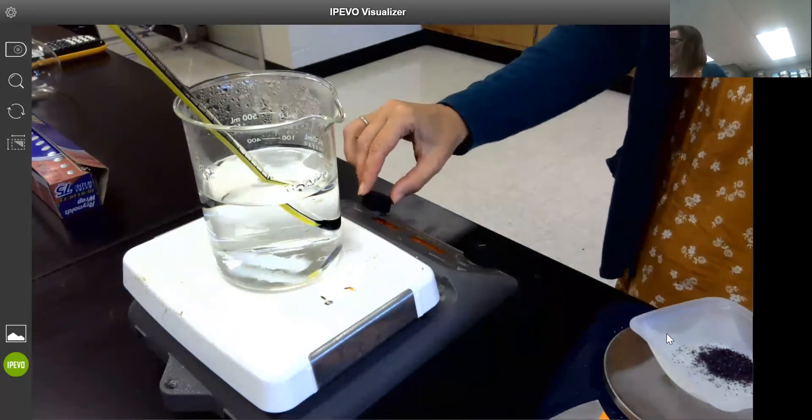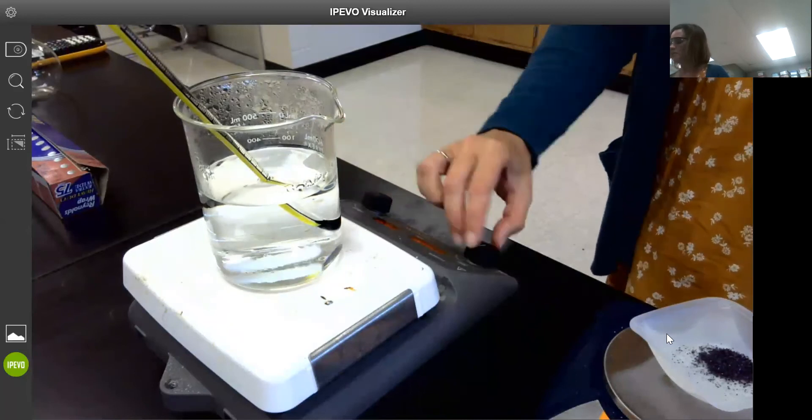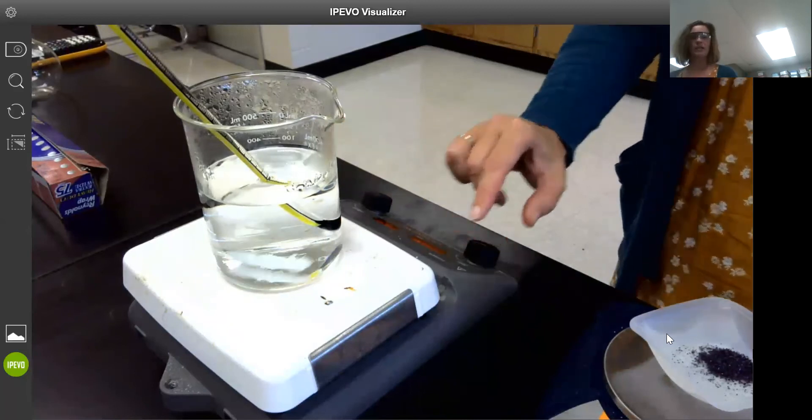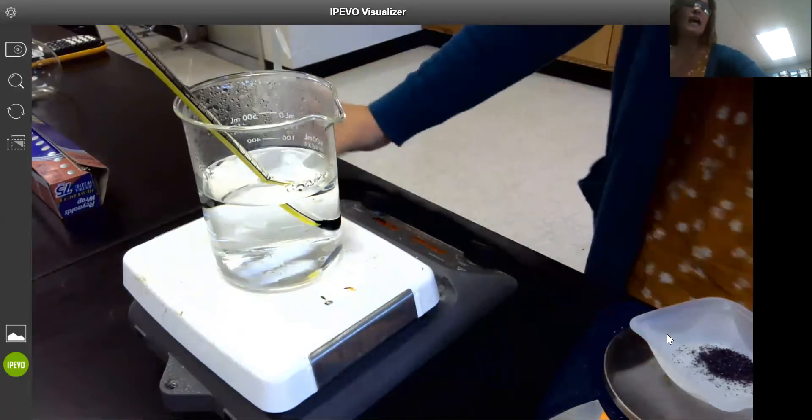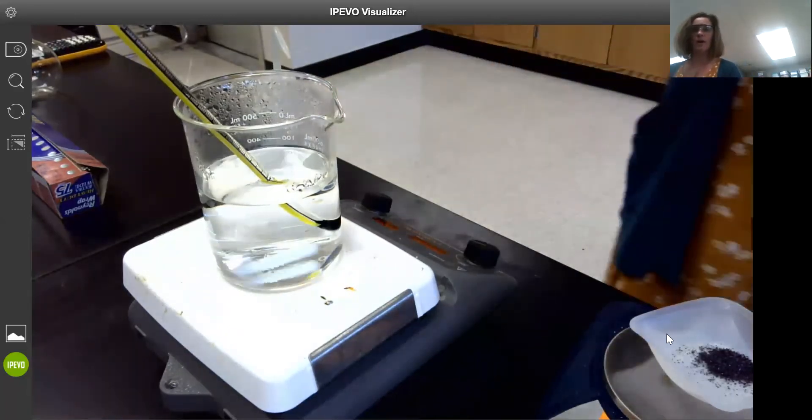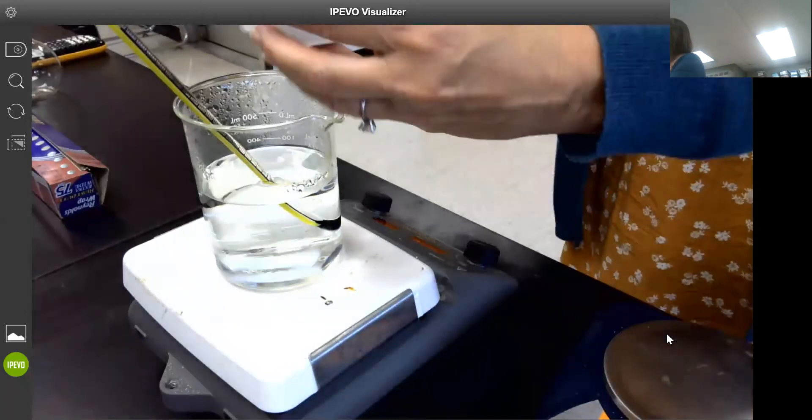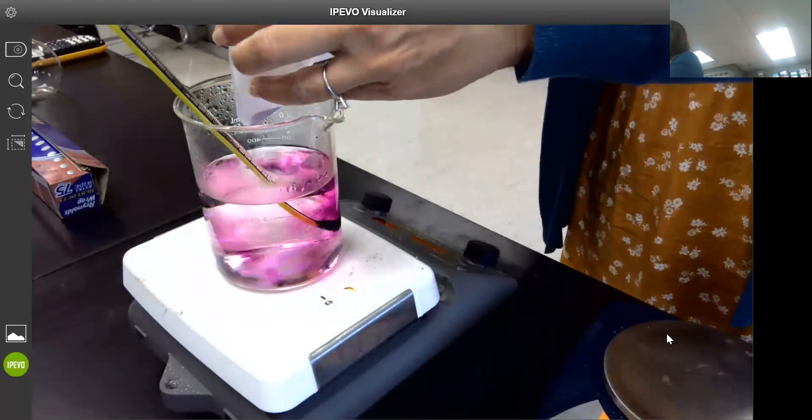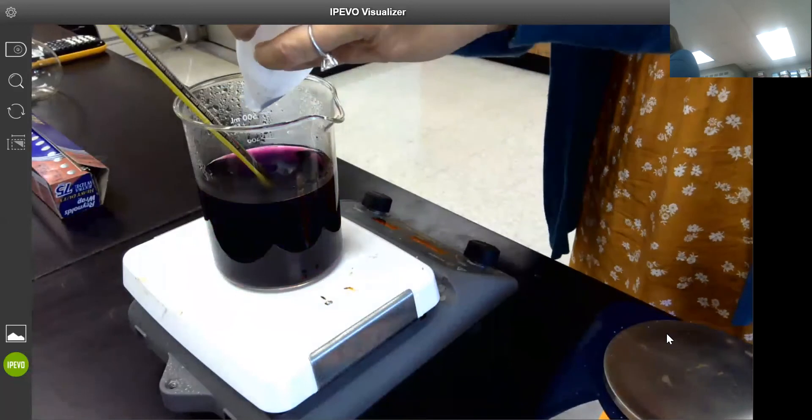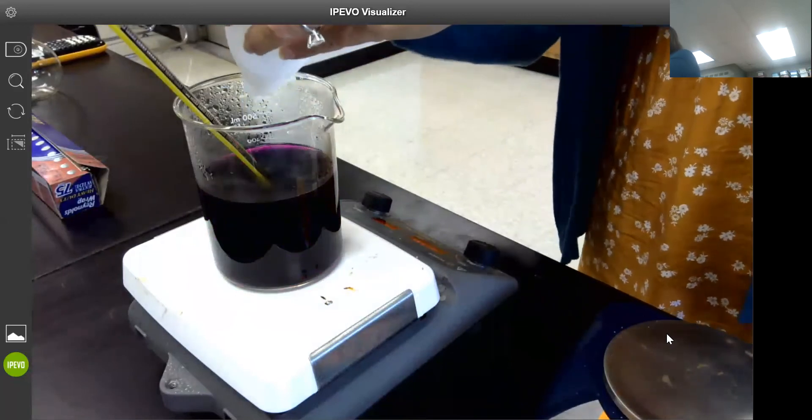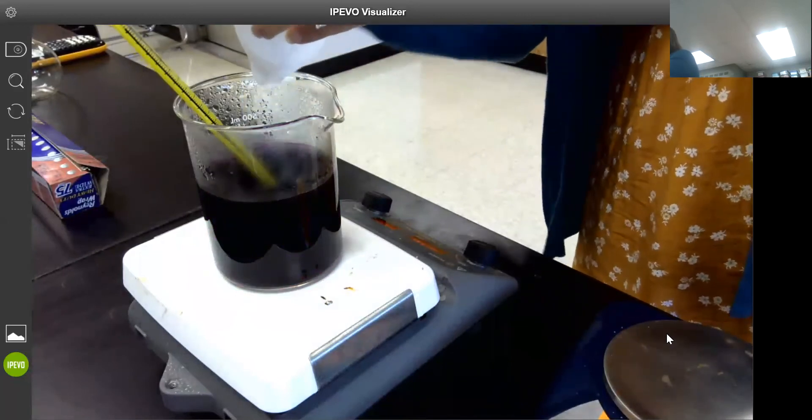I'm going to turn up the heat a little bit and turn up the stirring a little bit, and I'm going to add the KMnO4 to the beaker. You can see we get a real intense purple color when we do that. It looks like grape juice.